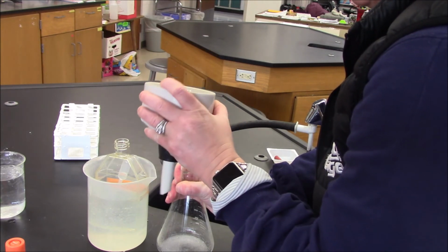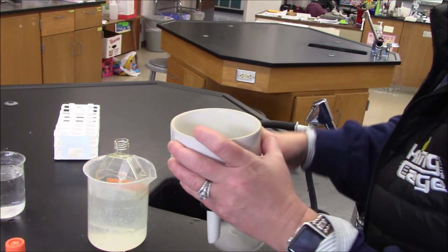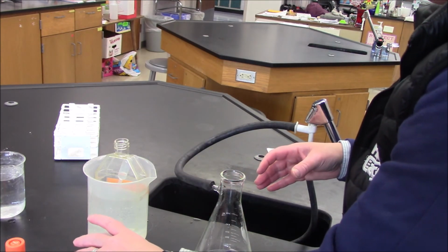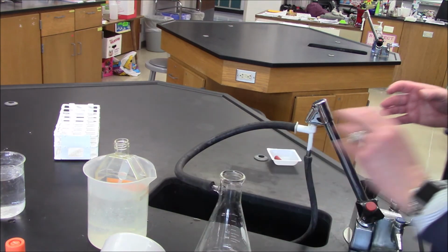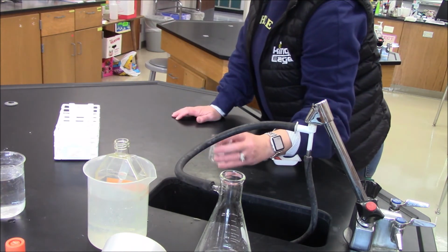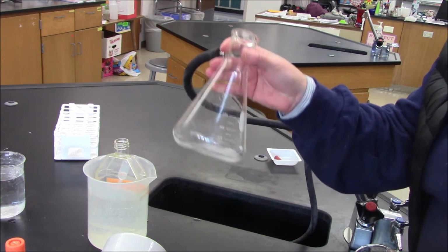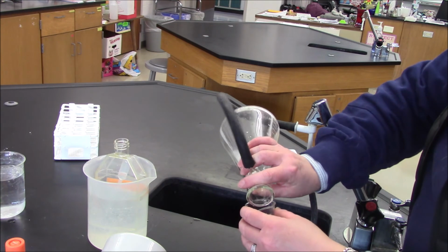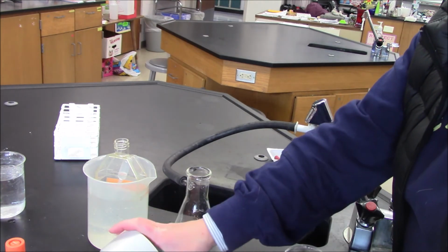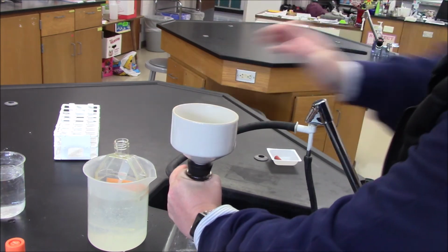I'm going to get a small beaker and try to filter this again. The good news is I still have some crude product, so I could maybe do a melting point test with my crude product. But what you can see is a lot of white stuff in the bottom of my flask. It's really not good. So let's see what happens here. Try this again. Maybe I can be a little bit more careful this time.